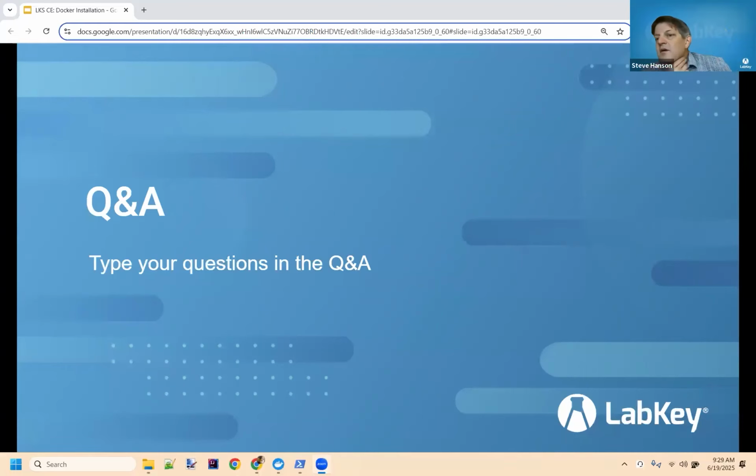Great. And here's another question. Renato asks, thanks for the presentation. Do you have an official community forum where we can chat or send issues or bugs to the core team?